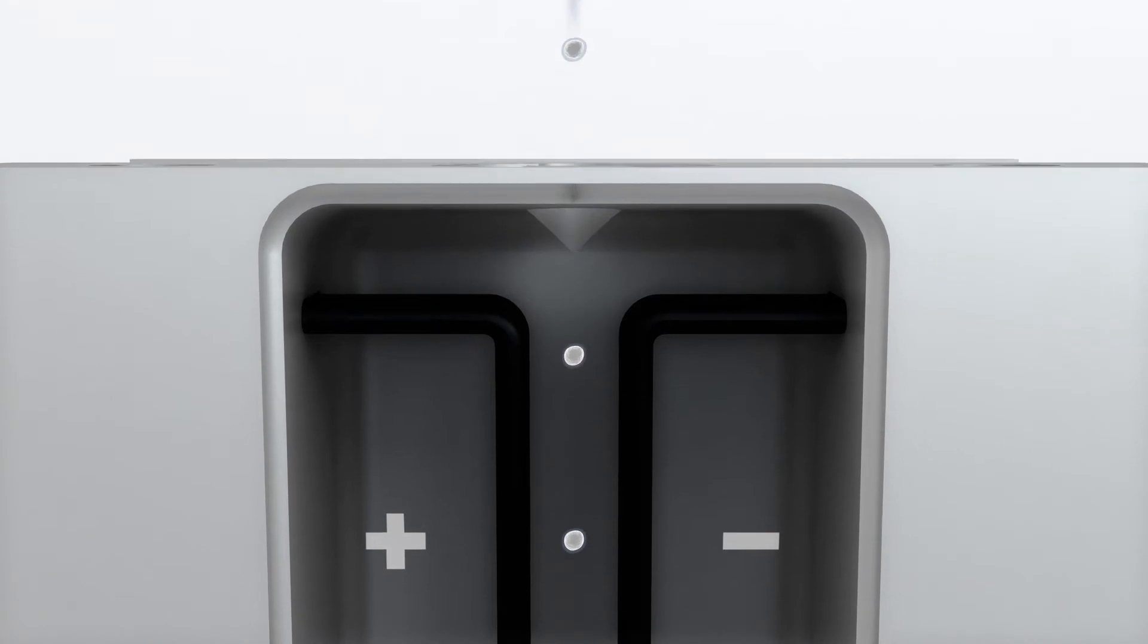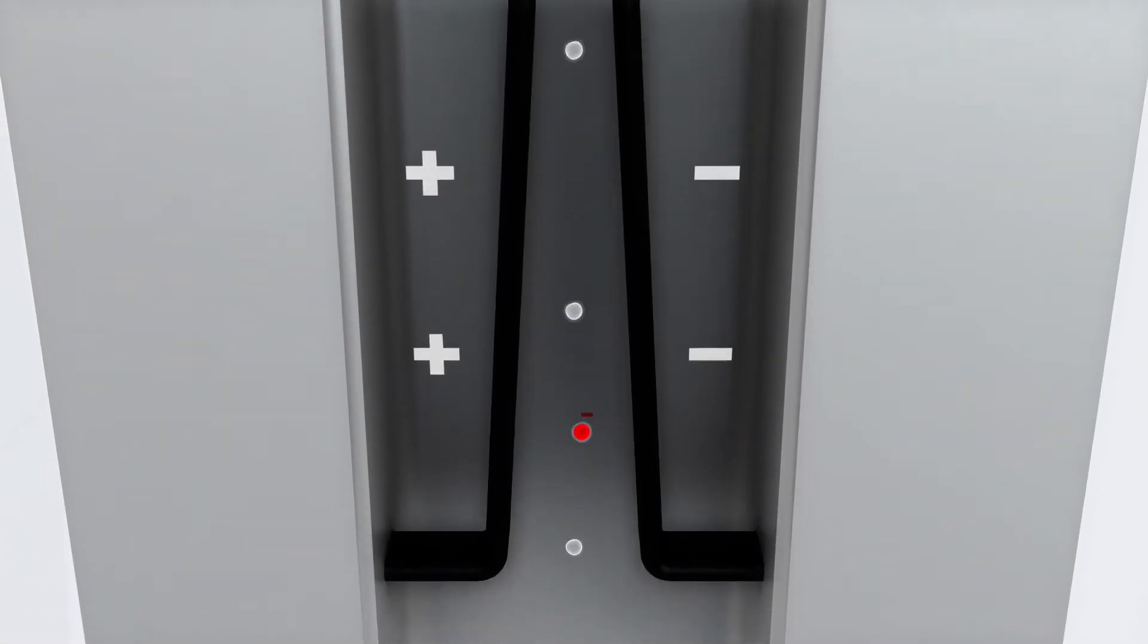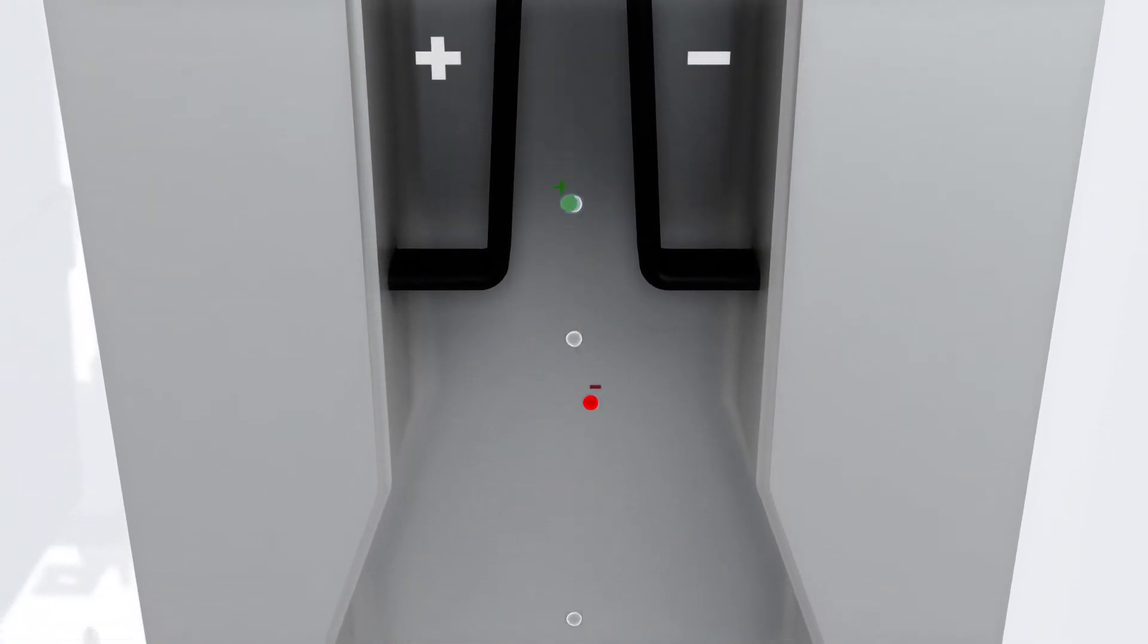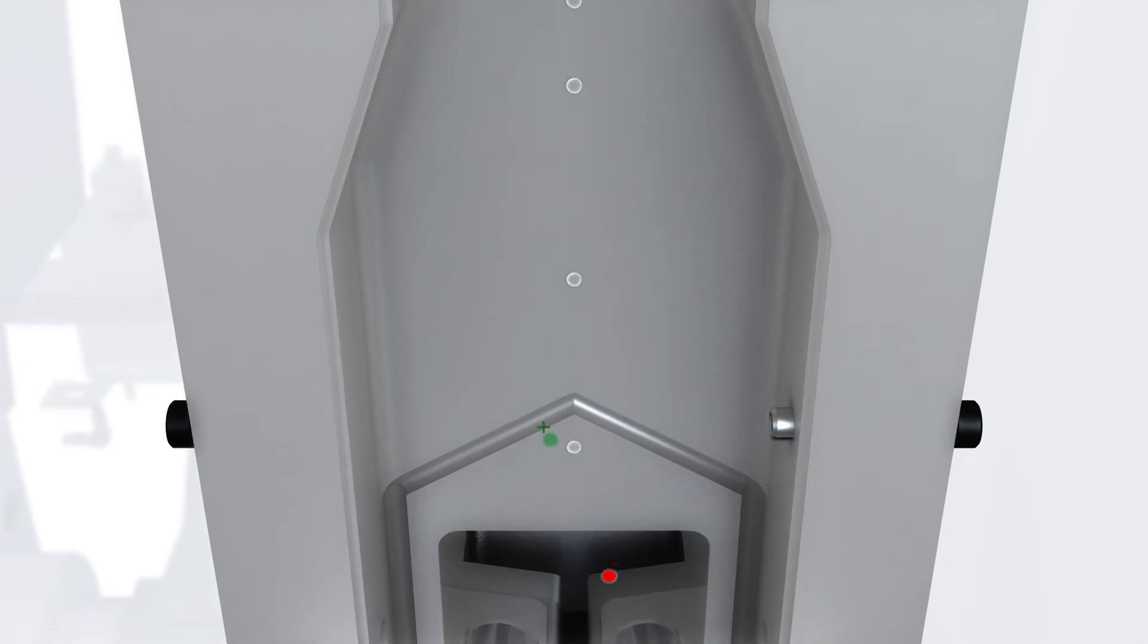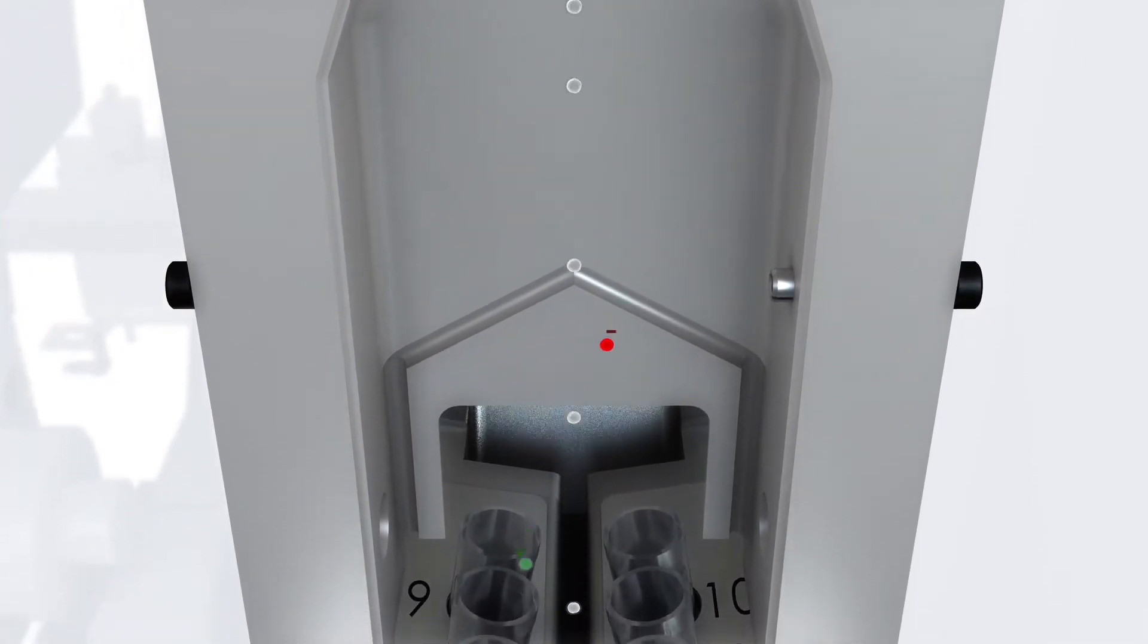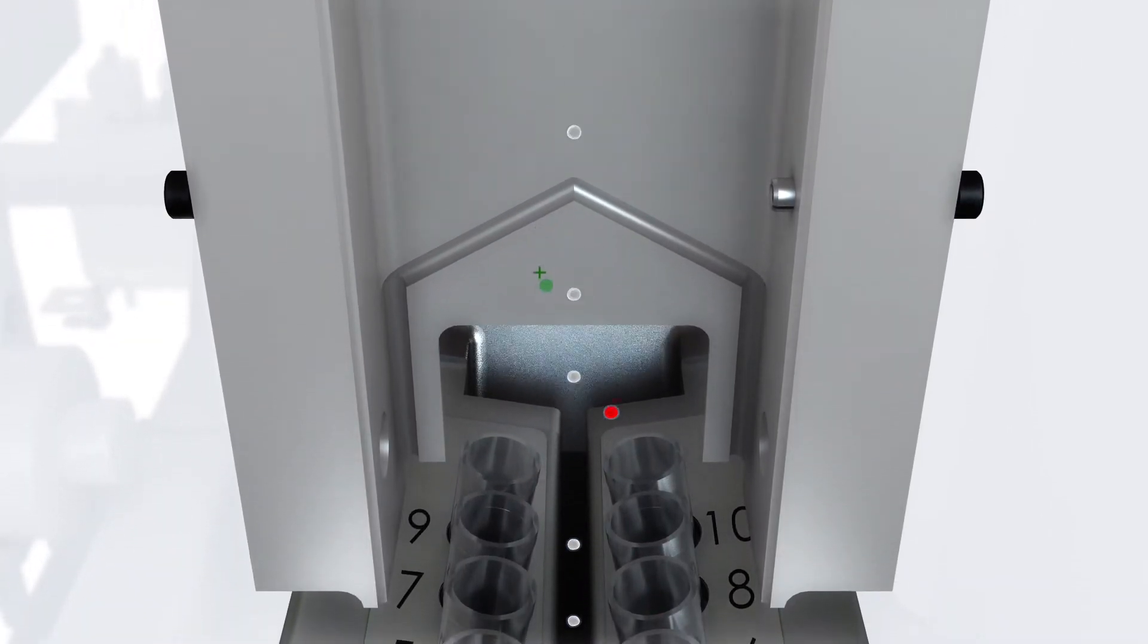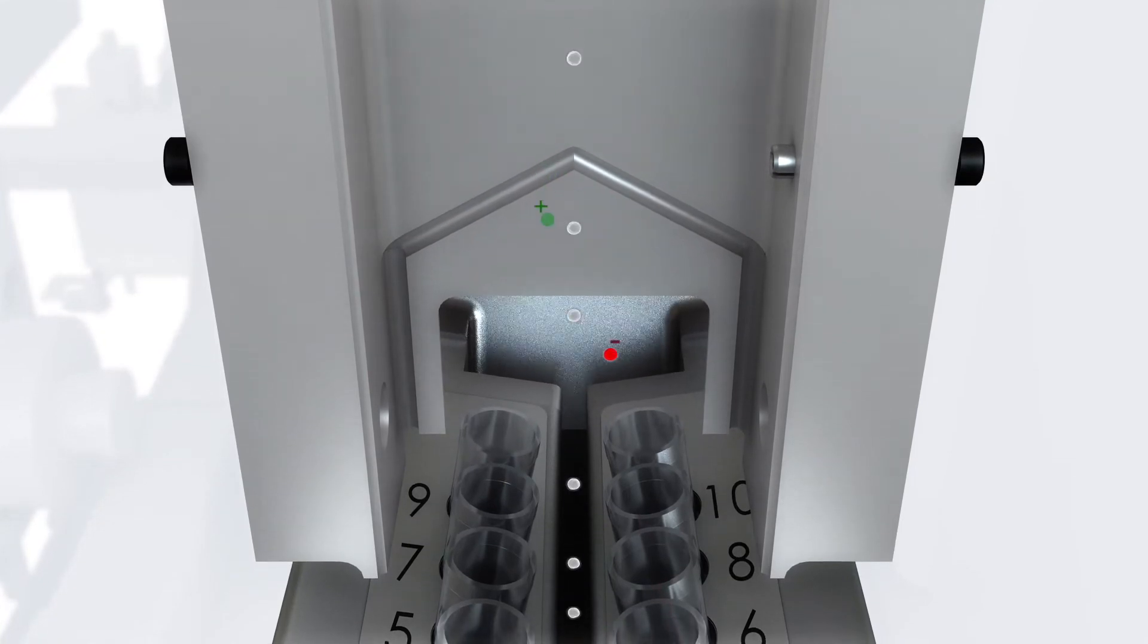During sorting, cells can die from shear forces due to rapid pressure changes in the fluid stream. Fluctuating stream dynamics also negatively impact sample purity. The S3E's jet-in-air system maintains a constant stream velocity to deliver samples with greater than 99% purity.